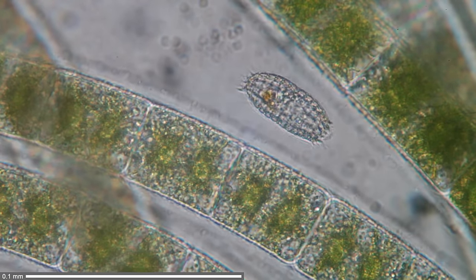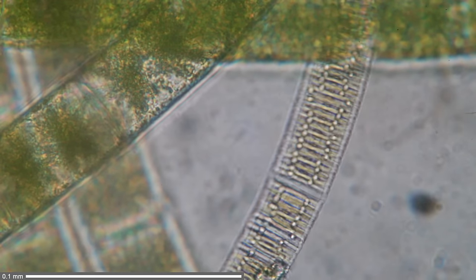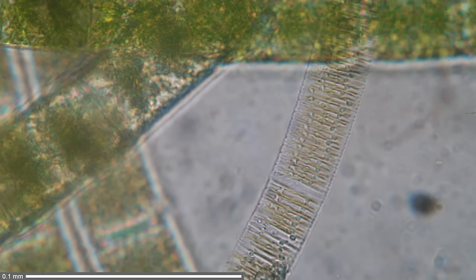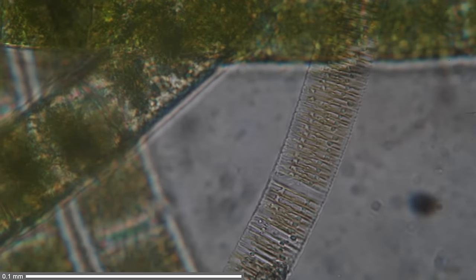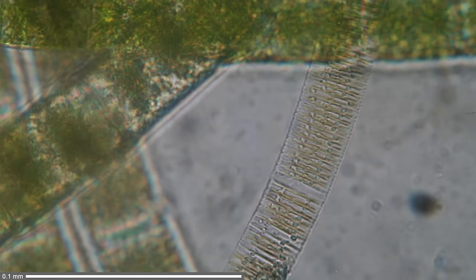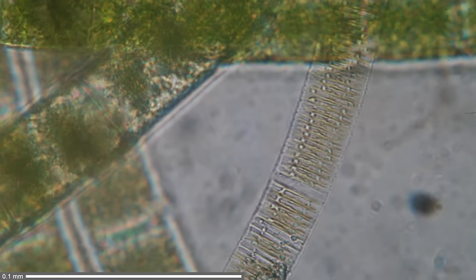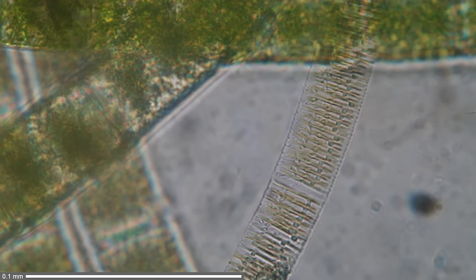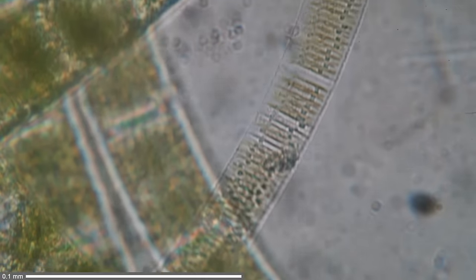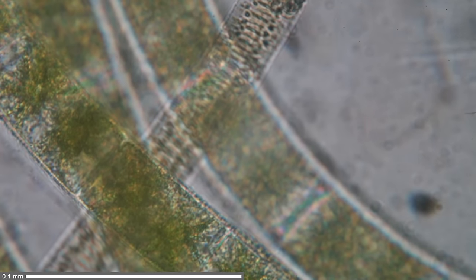This one seems to be diatoms. They have a very regular structure. I was playing around with the iris diaphragm a little bit, that's why the brightness changes. Very regular in structure. They have a silicon shell, which is essentially the same material as glass.